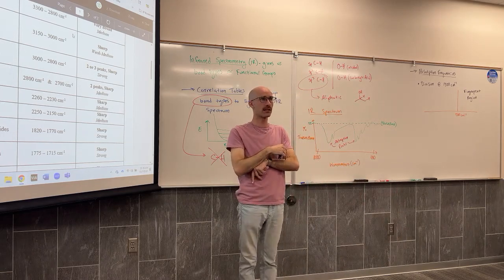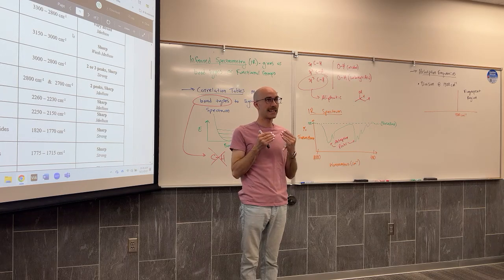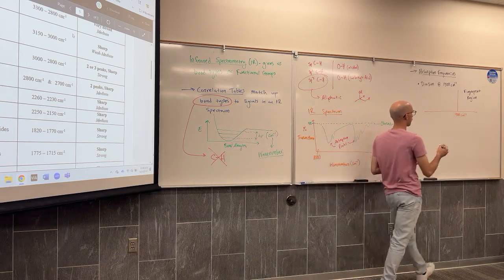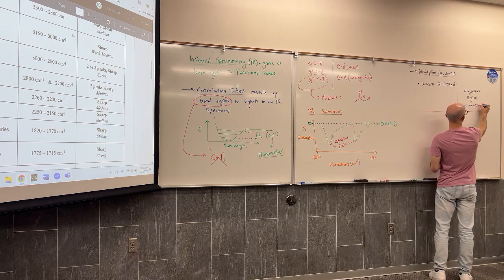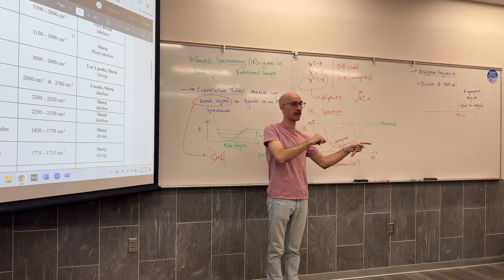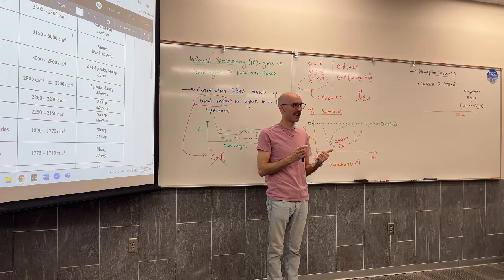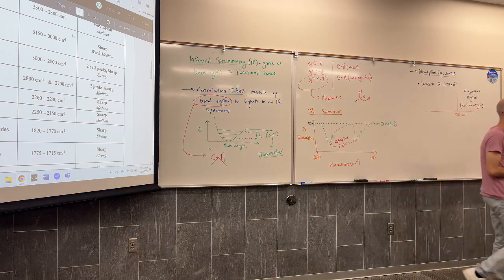In this region, a lot of different bonds absorb, making it challenging to identify what bond is responsible for what absorption. Some bonds only absorb in the fingerprint, which means those bonds are really hard to tell because you don't know if it's from that bond or from the plethora of bonds that absorb there.